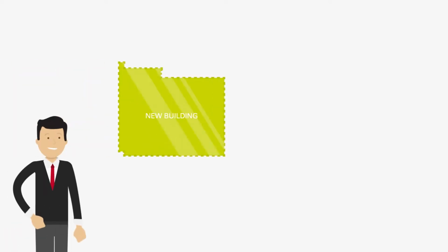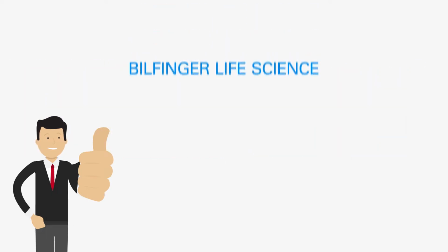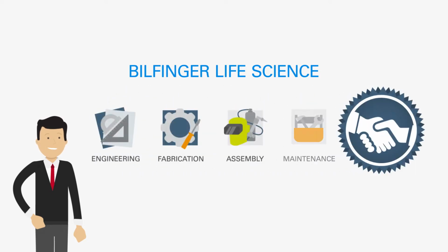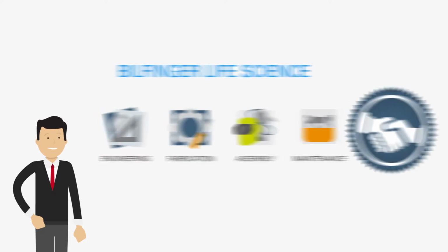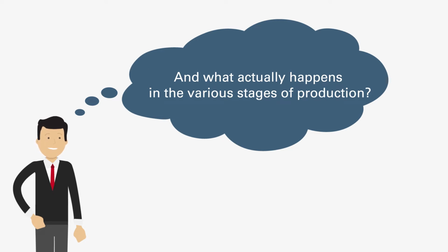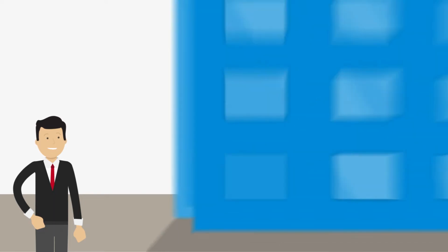Are you planning to build or expand your production facility? Great! Bilfinger is the professional partner that engineers and fabricates your entire facility, assemblies, and even maintains it. But what exactly does that mean, the entire facility? And what actually happens in the various stages of production? These are the questions we will answer in the next 4 minutes and show you an ideal production line.